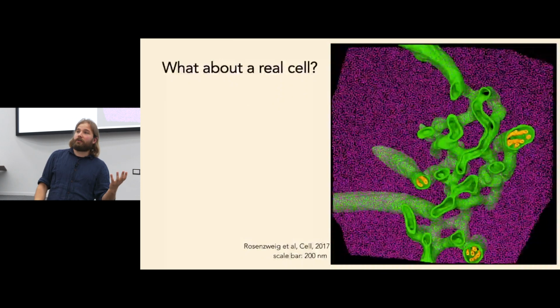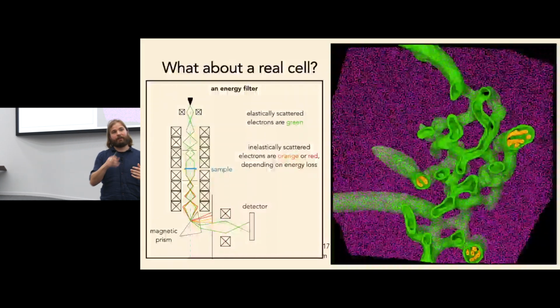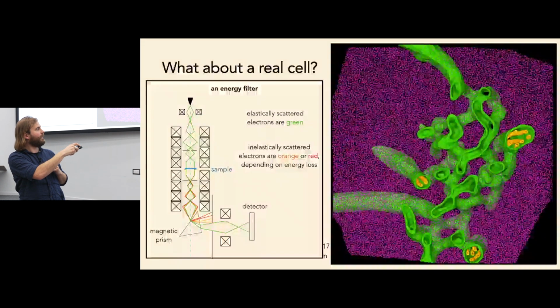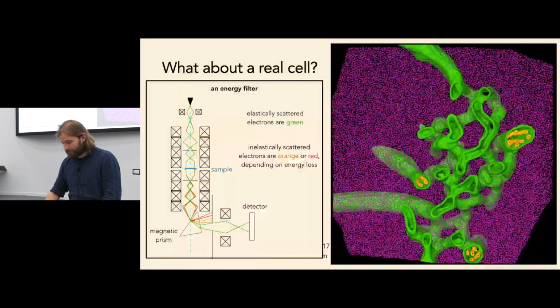The reason that these workers could do this is because they had an energy filter. So particularly with thick samples, a lot of your electrons will become scattered, and they'll become scattered inelastically. So we need to filter them out. And so this is approximately how this works. This is a sort of simple diagram of electron microscope. After the sample, we have these inelastically scattered electrons. We want to filter them out using an energy filter. Like everything else in EM, it's hideously expensive, so the energy filter costs about the same as one of Richard's 100 kV systems that he's developing with Mohammed.